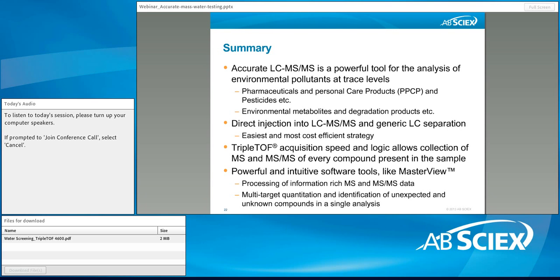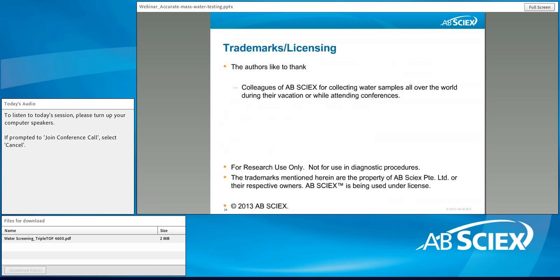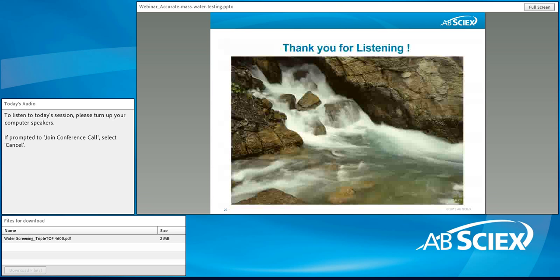identify targeted compounds in our samples based on MS and MS-MS information with very high confidence, or to identify unexpected compounds by finding molecular formulas for these compounds and then searching them against mass spectral libraries and the internet to look for matching structures.